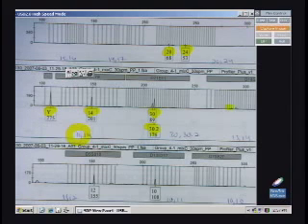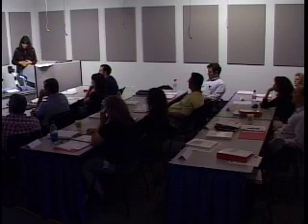It looks like maybe it was trying to get a 13, 14 there, but not quite. 12, but not the 11. And 10, but not the 11. And then these obviously didn't show up at all. Complete dropout.